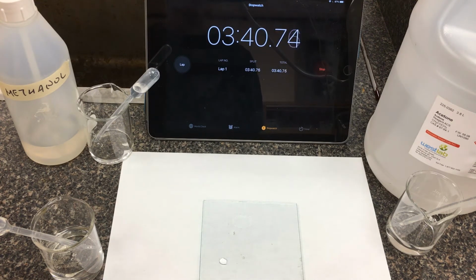Whenever we record times, even though our stopwatch has minutes and seconds there, we would usually just convert everything to seconds. So if you did want to do a rate calculation later on, when you have seconds, you can just divide by seconds here. Just waiting for this last little bit of methanol to evaporate off. Okay, the acetone had long gone.